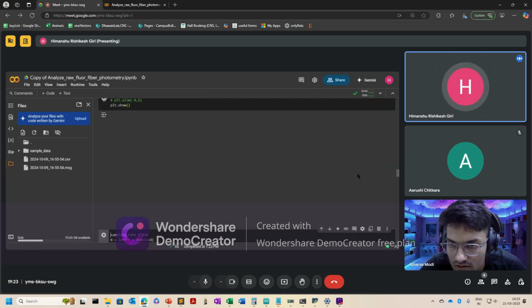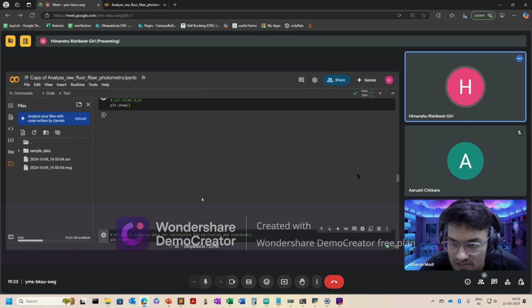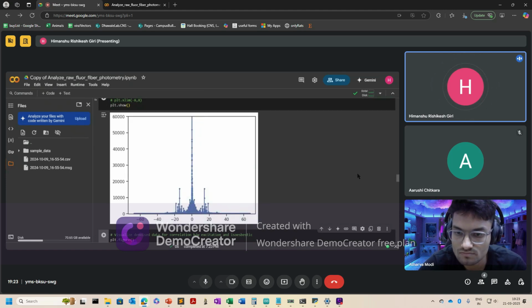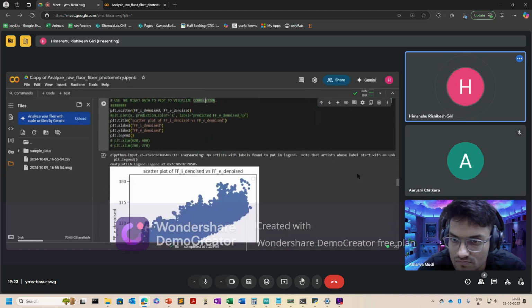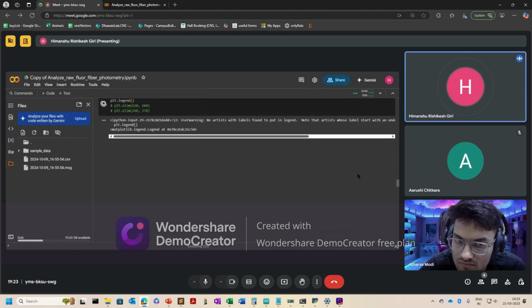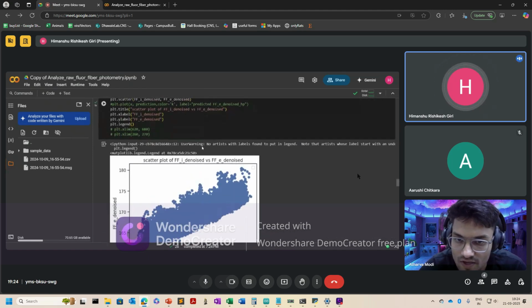This is denoised. And this is the correlation between E and I denoised. Yeah. After this we left.